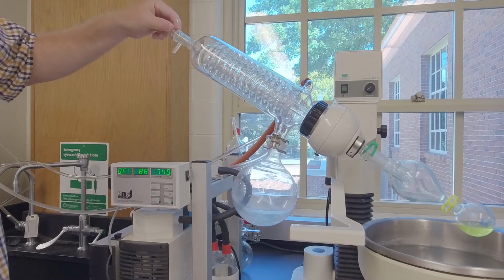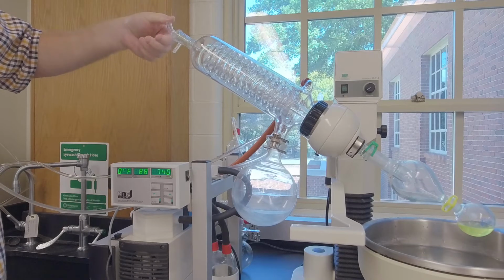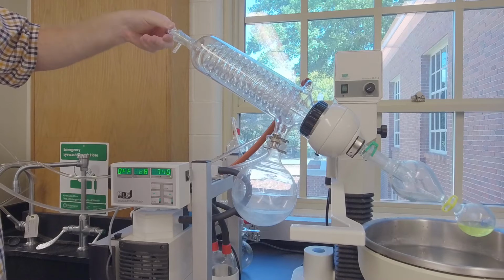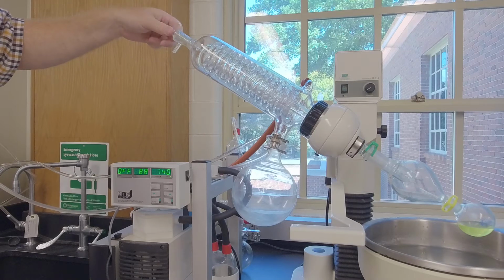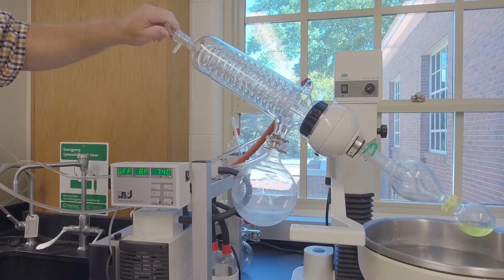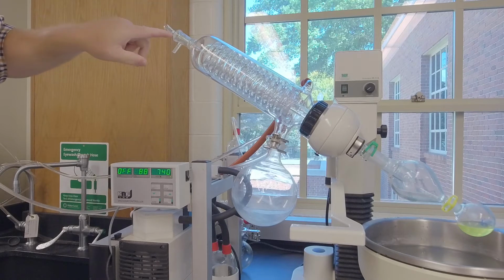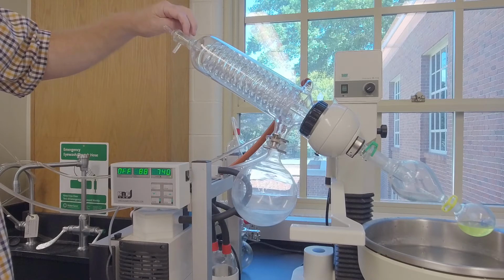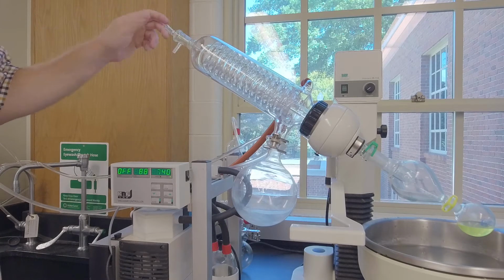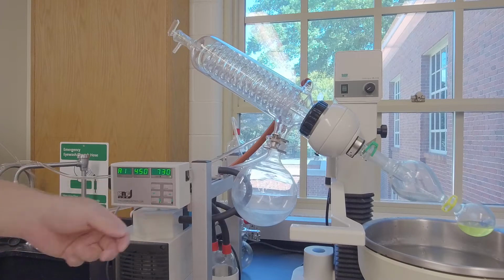How I adjust this stopcock tells me whether it's open or closed. And you'll just need to look at this, and I can demonstrate how you would hear it here in a minute. Okay, so it turns. Right now, it's open. There's a little hole in there. When the hole is not at this tube, or this opening in the glass, it's closed. I'm going to leave it open for now, and I'm going to hit auto on the vacuum.